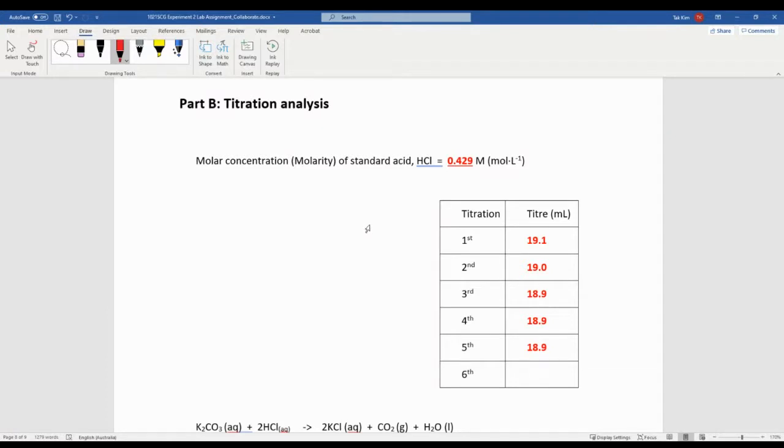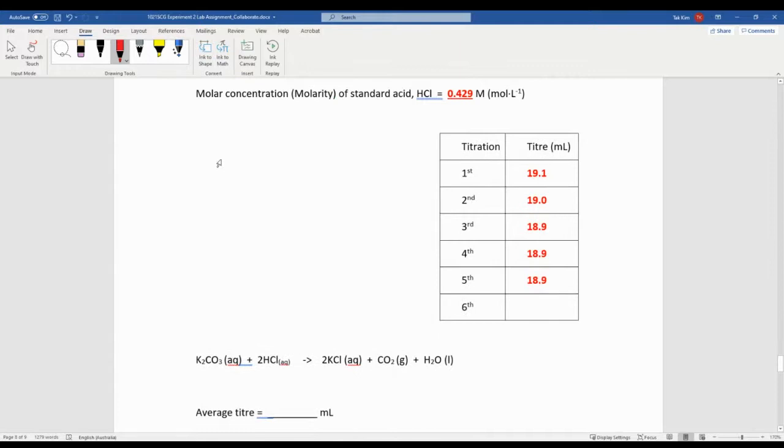But when it comes to titration, you are creating a sort of perfect stoichiometric ratio of your starting material. If you did titration before, you should understand how painful it is to meet the titration endpoint. Anyway, you should be able to have a look at how it works using the video link within your learning activities. Since I only have 8 minutes, I'll just move on to the calculation straight away.